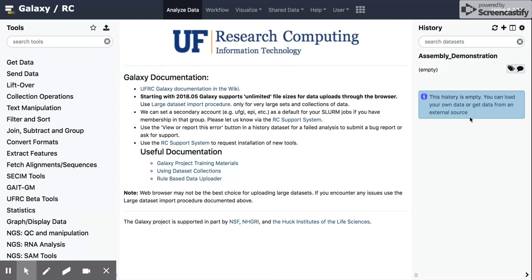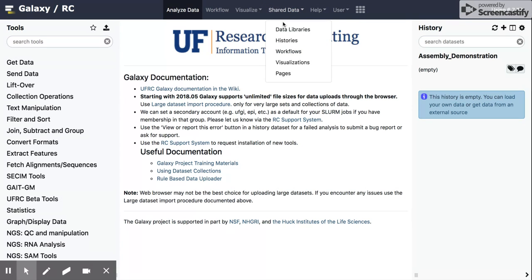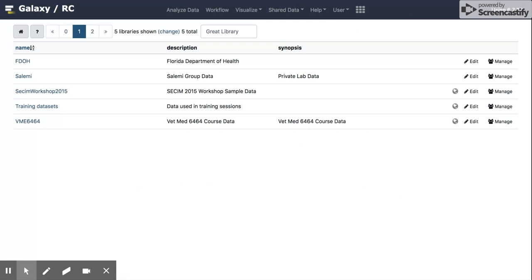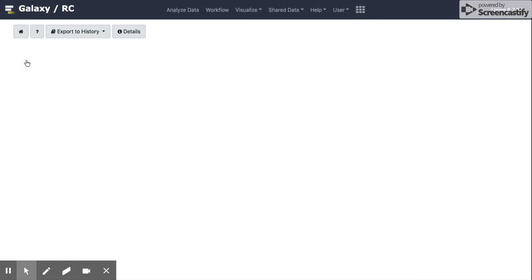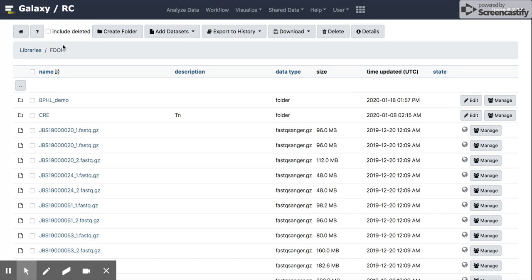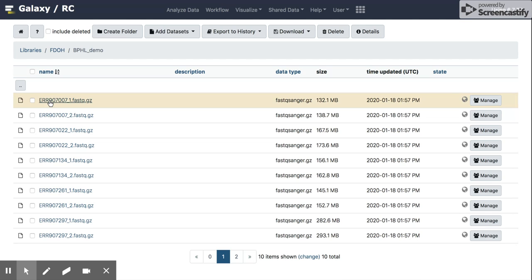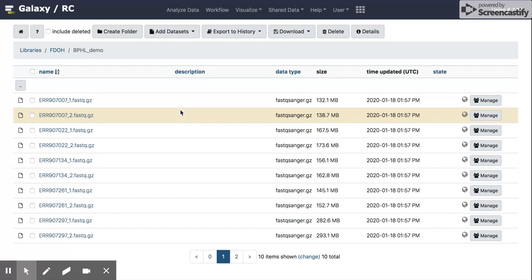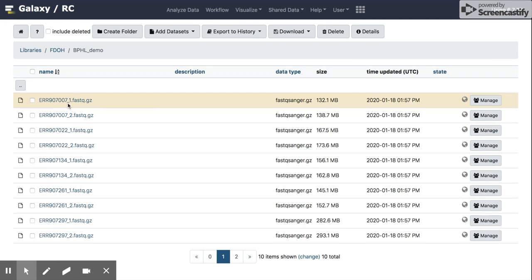Now, the first thing I want to do is add data to this history. If we go to our shared data, I'm going to click on data libraries, my folder. And you can create folders on here as well, but you should have a home folder on there. And I've created a folder for some demo information here. And what I have in here is about 10 sets of reads from Streptococcus pneumoniae serotype 3 isolates. And they are actually named based on their NCBI or SRA accession number.